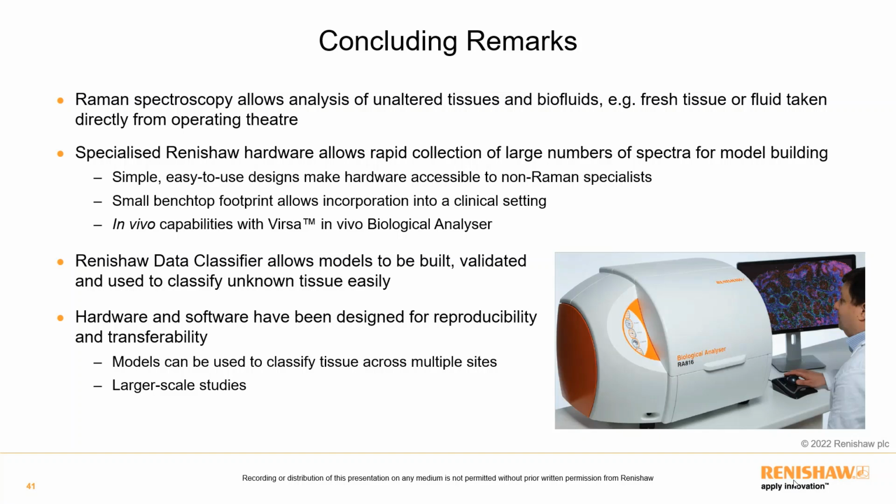At this stage, I would also like to reinforce that the Renishaw RA816 biological analyzer and the Virsa in vivo biological analyzer are designed for research purposes only, and whilst they can provide useful information to aid in the detection of disease, they should not be used as a routine diagnostic approach.